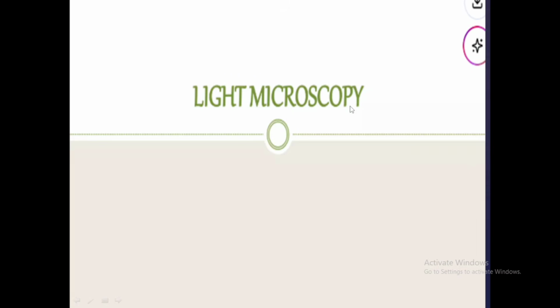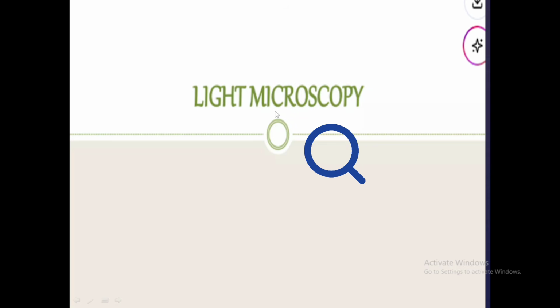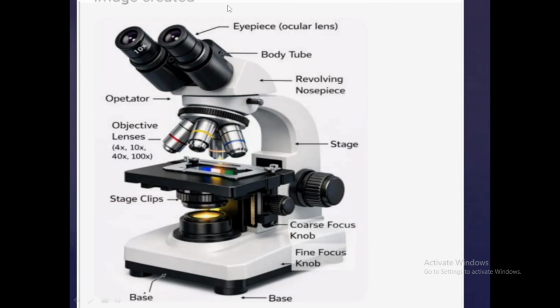I am Dr. Swati. In today's video, we are going to see the light microscope. In this video, we can see the definition, parts, and working principle of the light microscope. Let us start. This image is a light microscope. First, let us see the definition of a microscope.